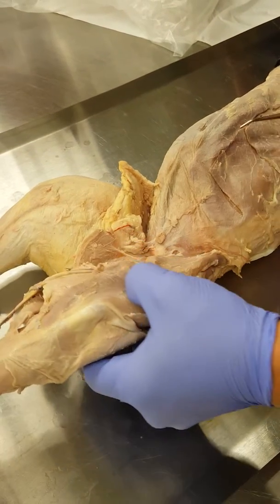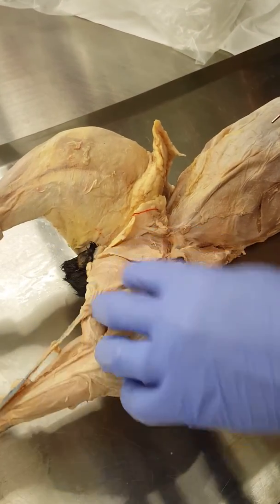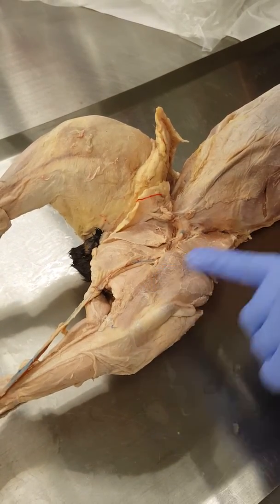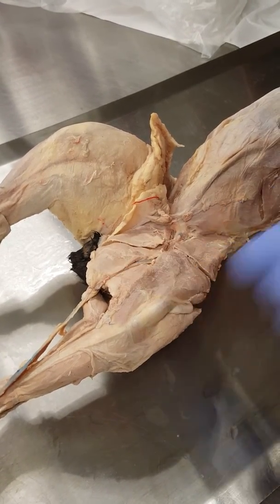And then over here, we can see the gracilis right here. And then gracilis, again, is a lot thicker on the cat than it is on the human, right? So there's sartorius here, and there's gracilis right there. Right? Sartorius, gracilis. Right?